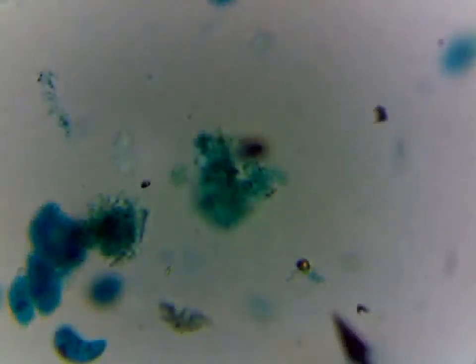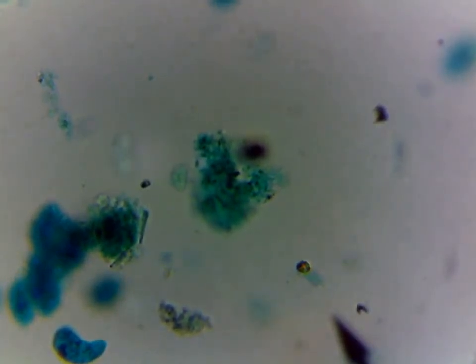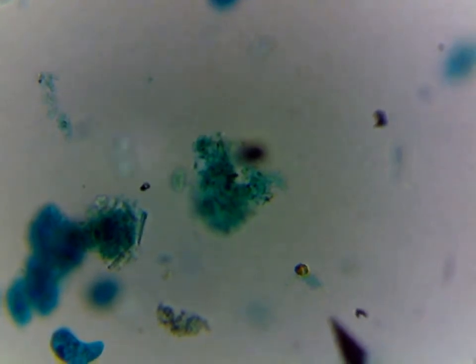Okay, and finally we are moving on to the amoeba. And this is the slide that's provided in the lab supply list, so I thought I'd use this one first. And we're going to take a look at an amoeba. They are very blob-like, and it's much harder to see the structures inside an amoeba. But there in the center is one amoeba, green.